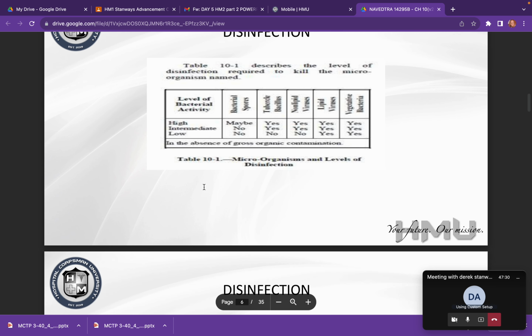So it can kill bacterial spores, tuberculosis, germs, non-lipid viruses, lipid viruses, and gram-negative vegetative bacteria. I was talking about Cavi wipes with the contact time of 2 to 3 minutes. If that stay time of 3 minutes is going to kill all those spores, compared to leaving it on 2 minutes where it might only kill half of them. So like I said, if you read that Cavi wipe bottle, it'll tell you which of those spores it kills based off the contact time.